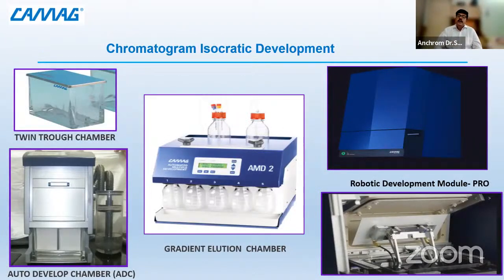Then you have the development part. In the development part, the plate, once it has been applied, goes for development. We place the plate in a twin trough, we develop it, and after the development, the separation of the compounds happens. After the separation happens, we see those bands, and from that we get a confirmation. Now this is happening again with different instruments. The manual one, the left hand side, is the ADC2, left hand side bottom, which has that small glass chamber, if you can see, which is for the humidity control.